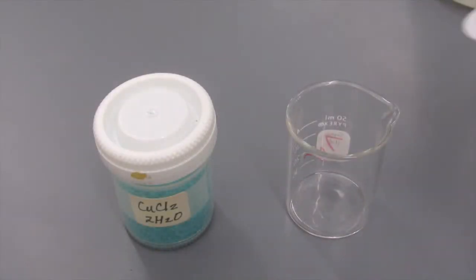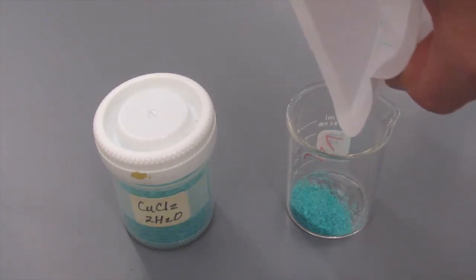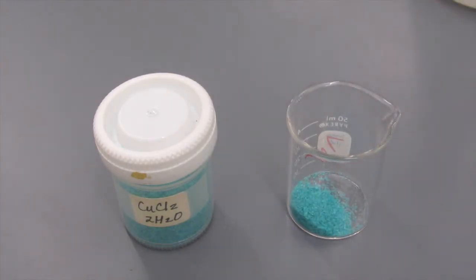When you're ready to go, the copper chloride is placed in a small beaker. To the copper chloride, we're going to add about 25 milliliters of deionized water.